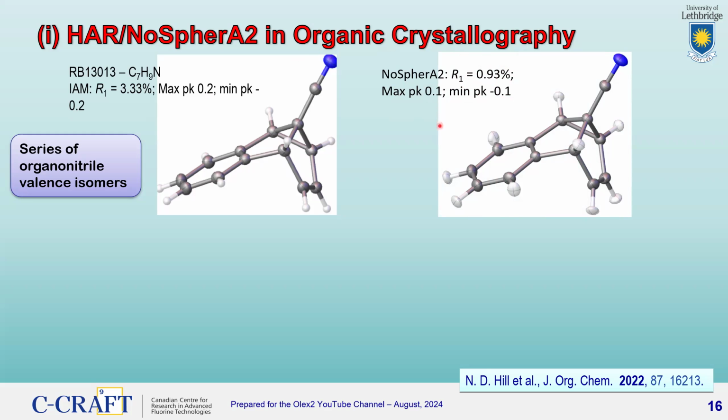Okay, and it's a little bit subtle from the picture here, but you can see that now we have all the hydrogens at their true CH bond distances, depending on the relative hybridizations of the carbons, and all the hydrogens have anisotropic displacement parameters, just like the heavy atoms. So that rather than omitting the hydrogens from the structure picture for clarity, we can now display the hydrogens for accuracy. And I think that's rather the better way to go.